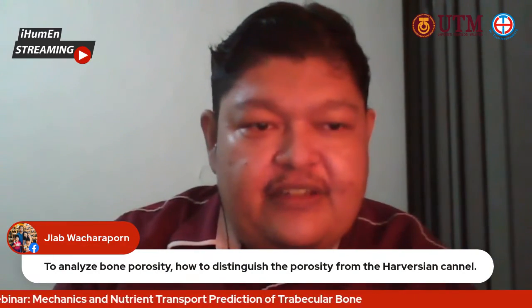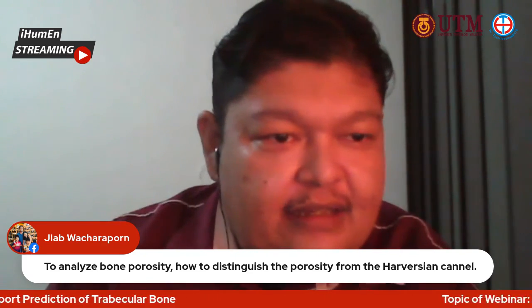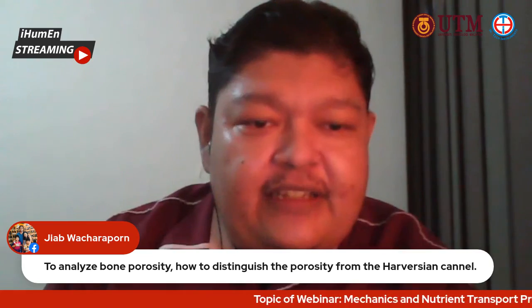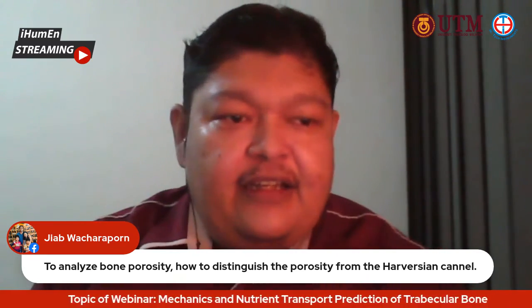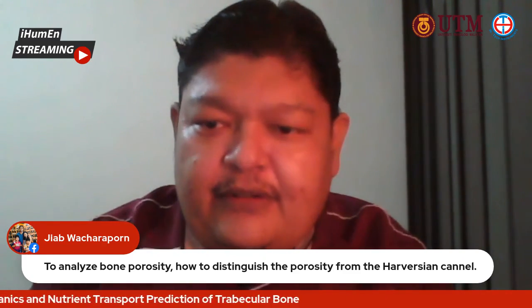There's one question from, sorry if I mispronounced your name, Miss Jiap Wachapron. To analyze bone porosity, how to distinguish the porosity from the Haversian channel? I open to the presenters for the answer.